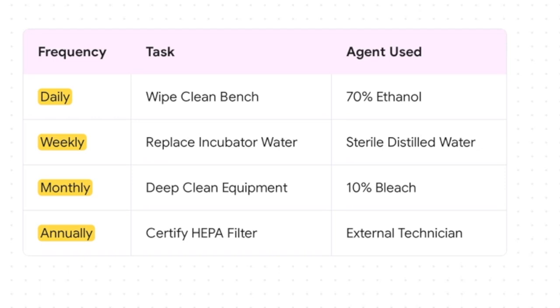You've heard the saying, right? In the lab, it's 100% true. The best defense is a good offense. And this is exactly what the offense looks like. It's a rigorous, non-stop schedule of maintenance.